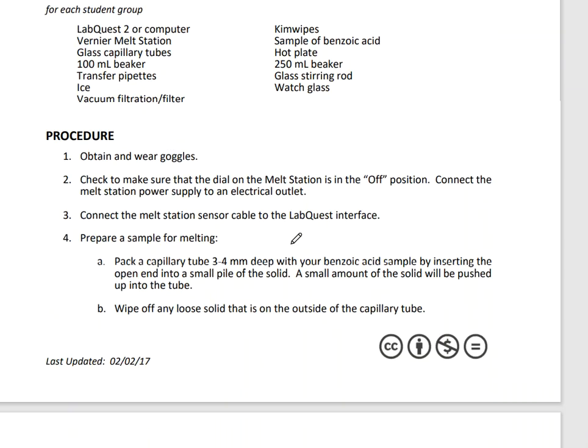All right, so procedure number one, we're going to wear some goggles. I don't think it's drastic. It's benzoic acid. It's a very common substance. It's pretty safe, but every time we're in the lab, we typically want to wear goggles.